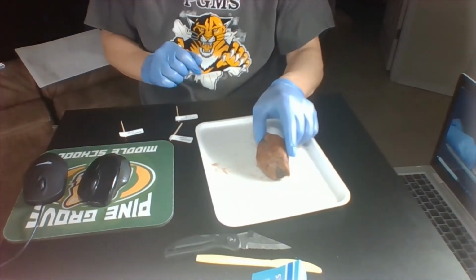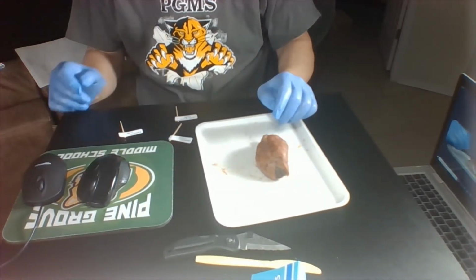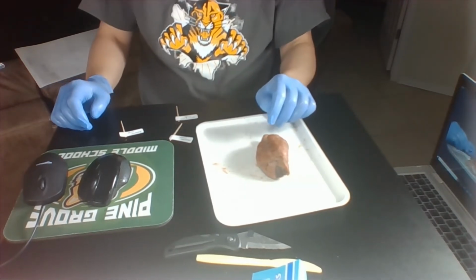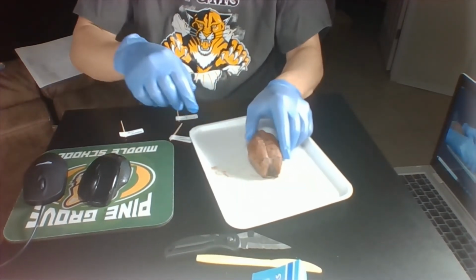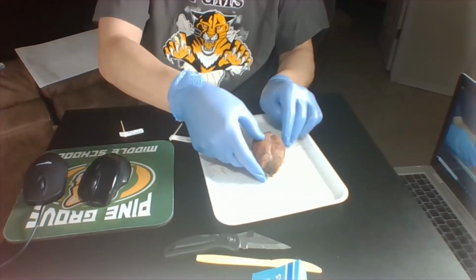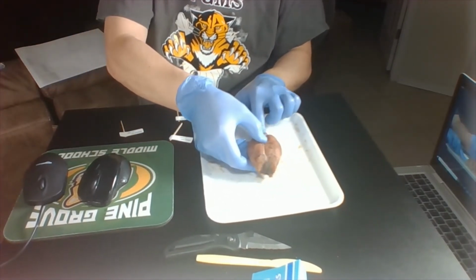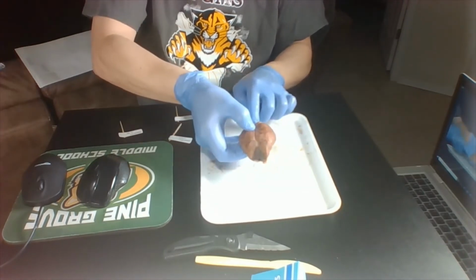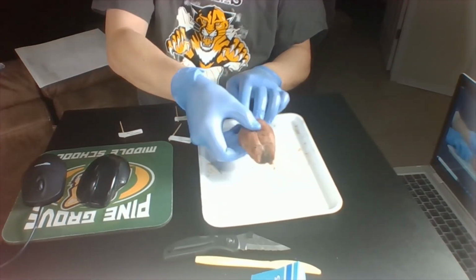Okay, the next identifications are going to be the frontal lobe, the parietal lobe, and the occipital lobe. So the frontal lobe, just think of it, it's the front. So if you can remember, the brainstem was in the back of the sheep brain. And like I said, I'll keep turning it so we can see the different angles and you can get the different views.